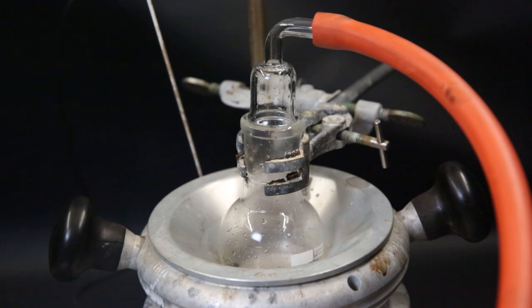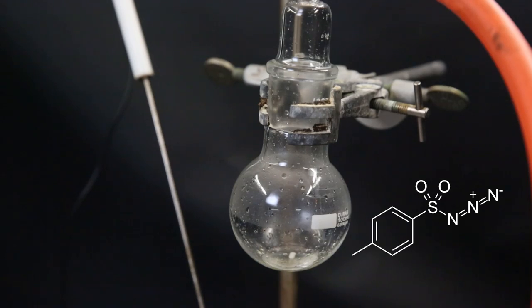After a while, all of the ether is gone and I am left with a clear liquid at the bottom of the flask, which should be the pure azide.